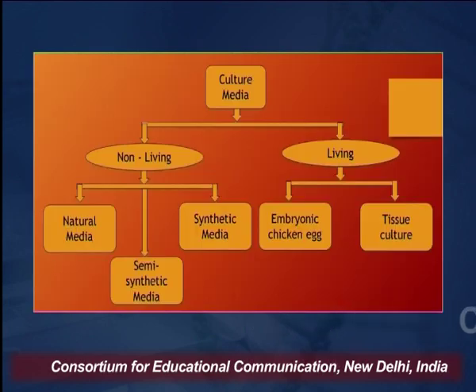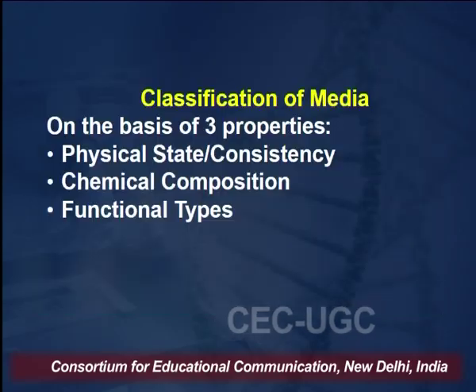So, as you can see in this chart, there are different kinds of media depending upon what you are using in the media. If your media is derived from the living or the non-living, the media which is derived from the non-living can be considered as the natural media or the synthetic media. The media which is derived from the living is the tissue culture media.